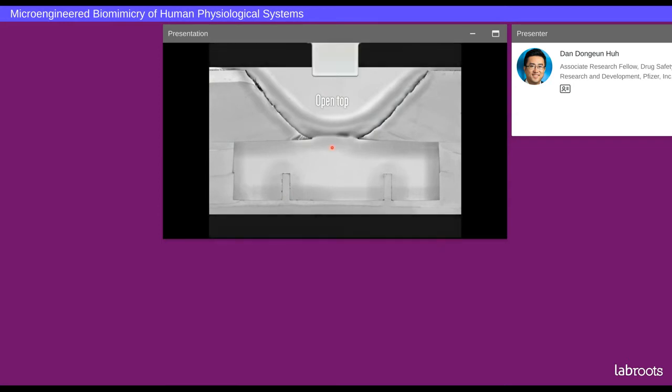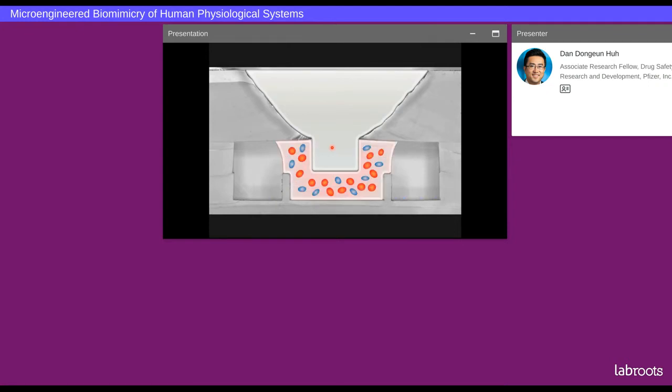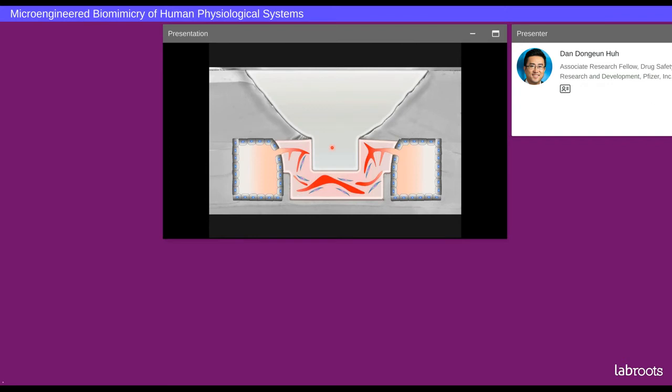So in this system, the first thing we do is we put in this insert. We form the vessels following the same protocol. When tumor samples that are not easy to get become available, we bring these tumor tissues, open up the compartment, and put the tumor constructs into the chamber, into the hydrogel, and we vascularize them.